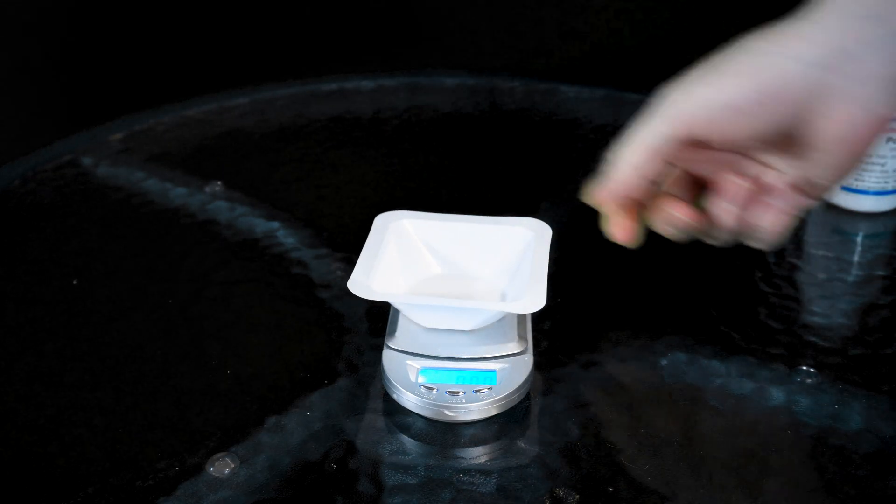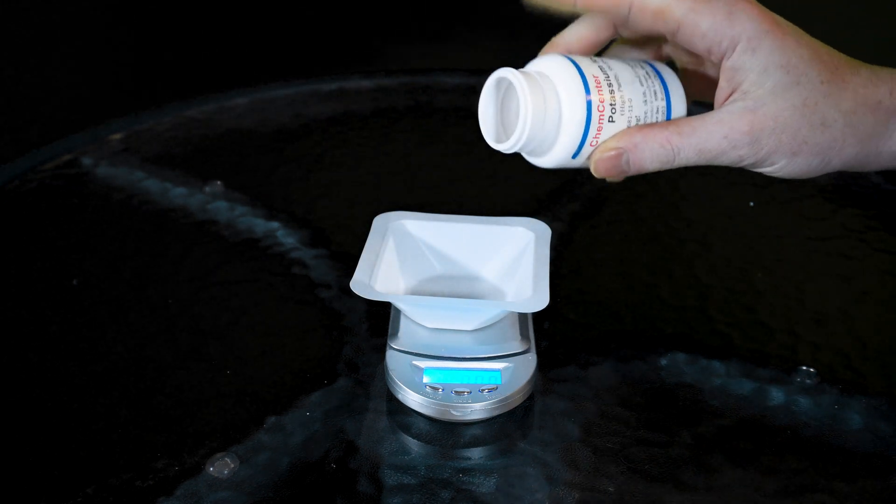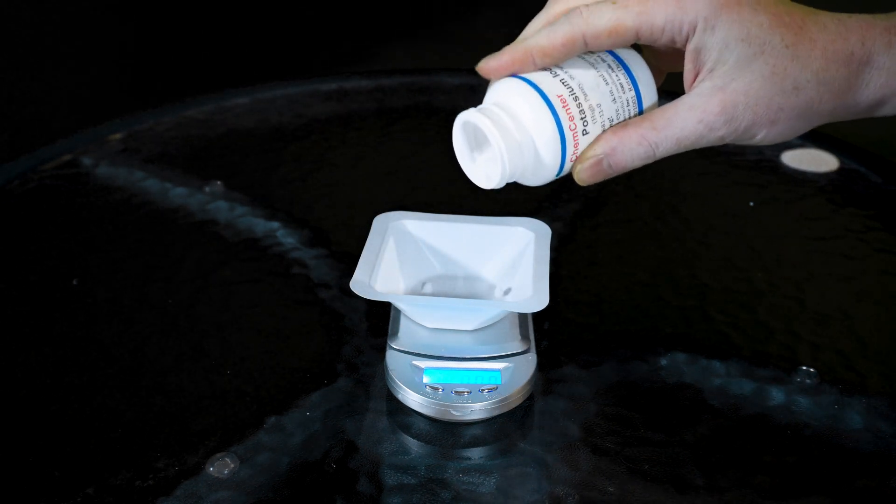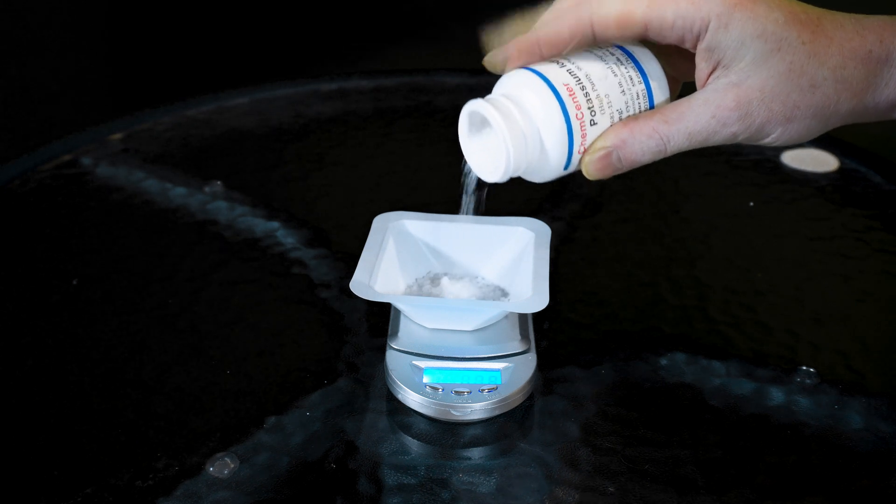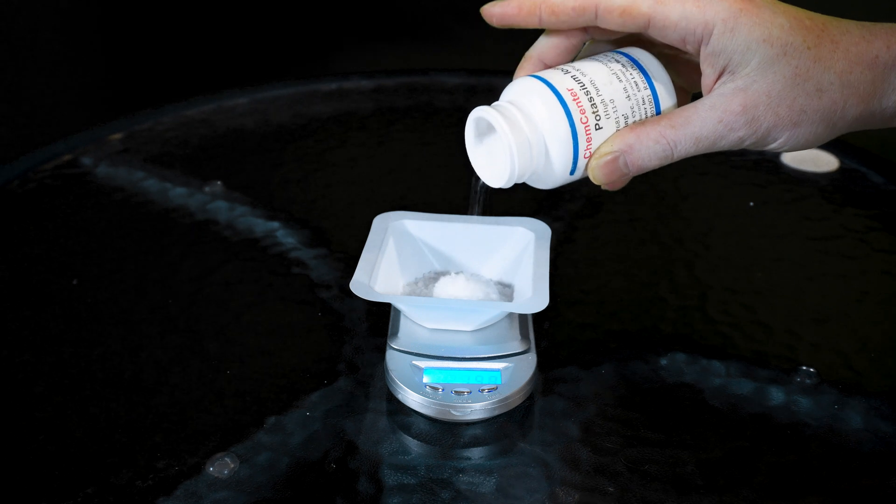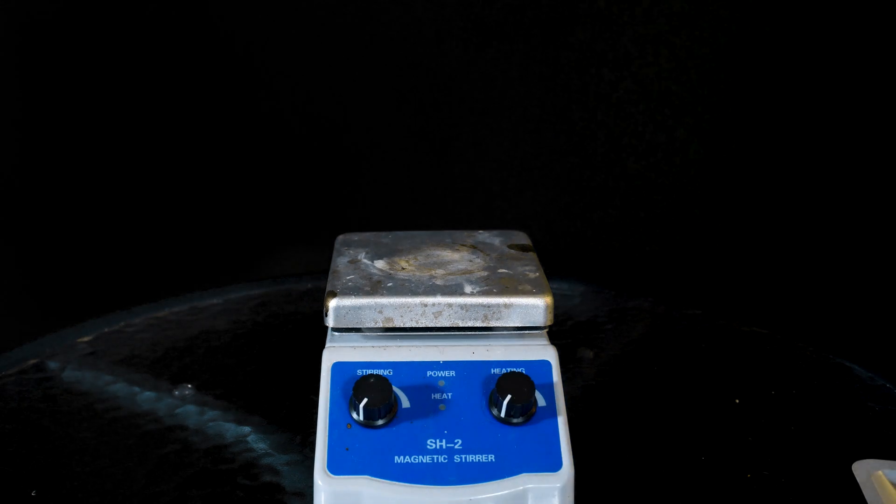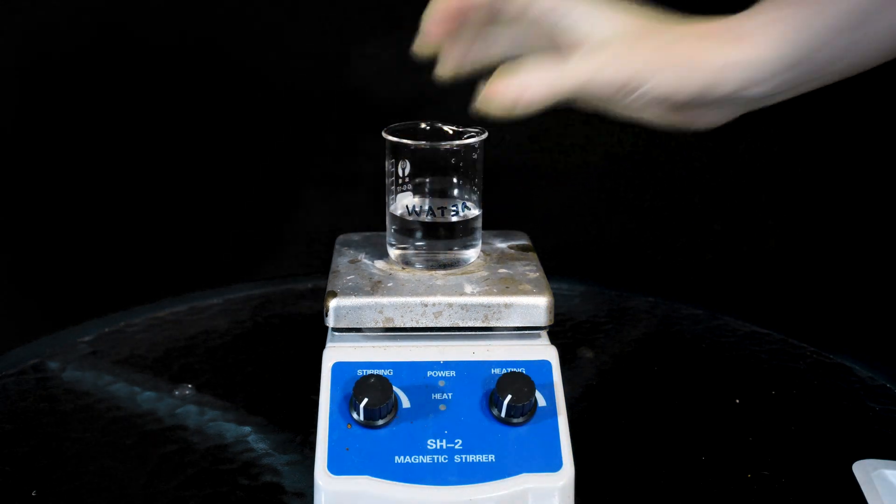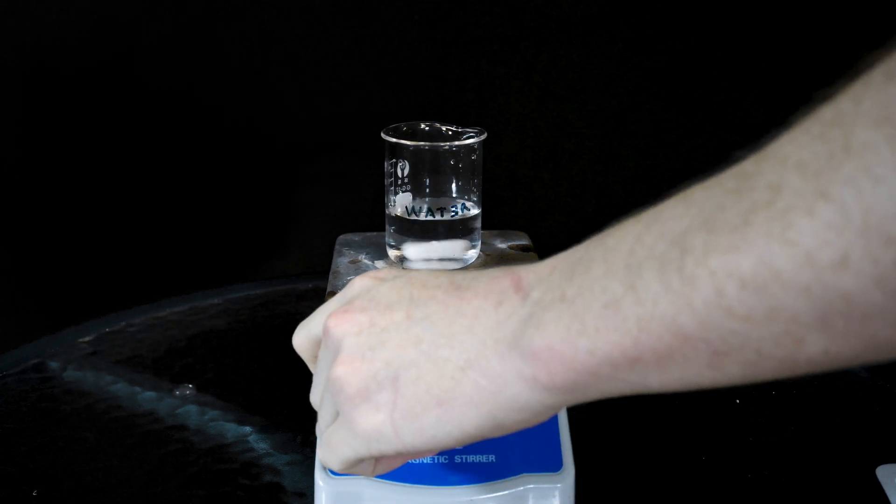We start out by weighing out about 26 to 27 grams of potassium iodide. The amount really isn't all that important, but I've found this gets me more than I'll ever need. It's dissolved in about 50 milliliters of room temp tap water. We'll use colder water later when we don't want to dissolve it as easily.